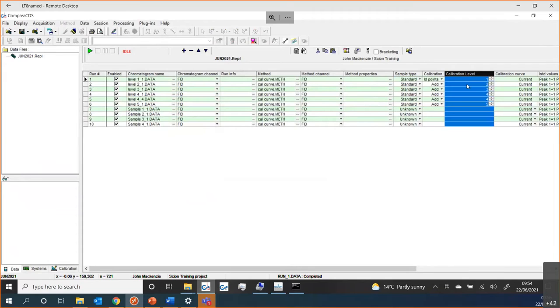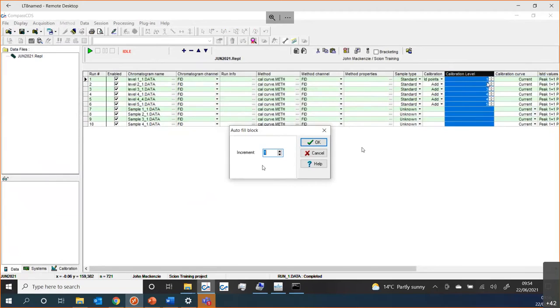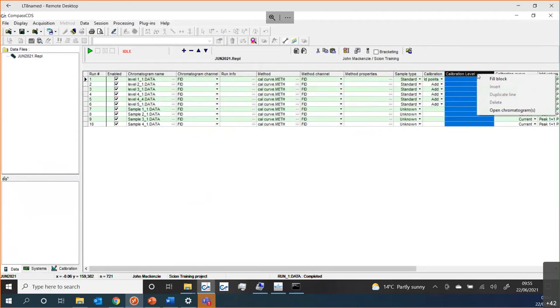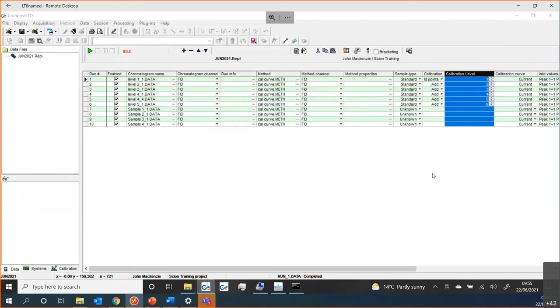I could go down the list adding each one, but that becomes problematic with a long list. When my mouse changes from a left-pointing to a right-pointing pointer, it allows me to just select items on the list. I can then right-click and choose Fill Block to update all the highlighted ones. For the calibration level column, right-clicking gives me an increment option — I want an increment of one — and it will add that to my list.